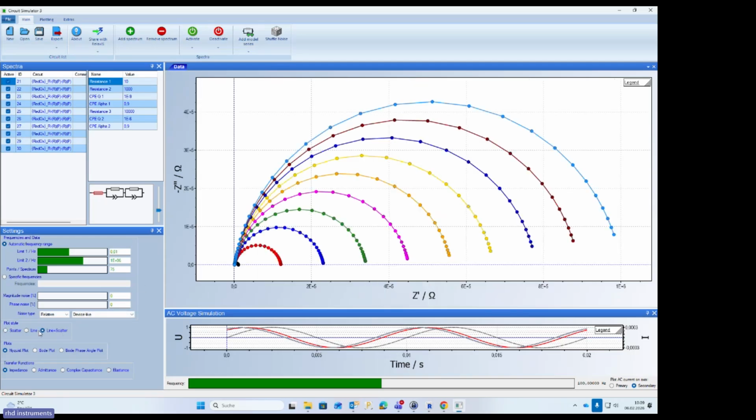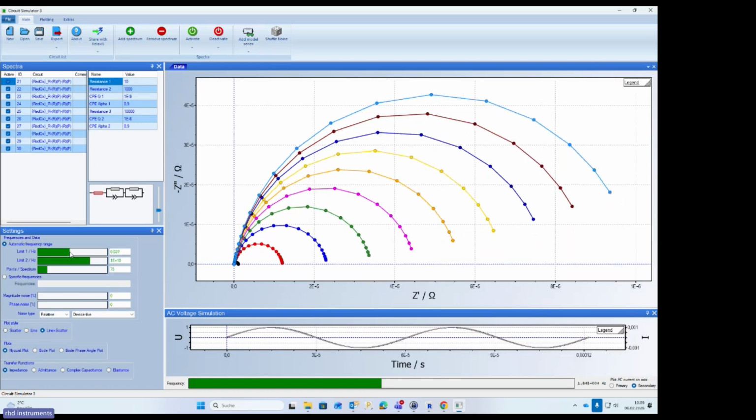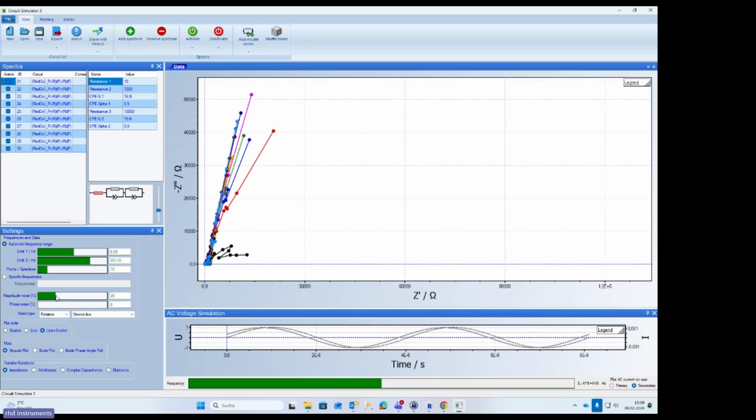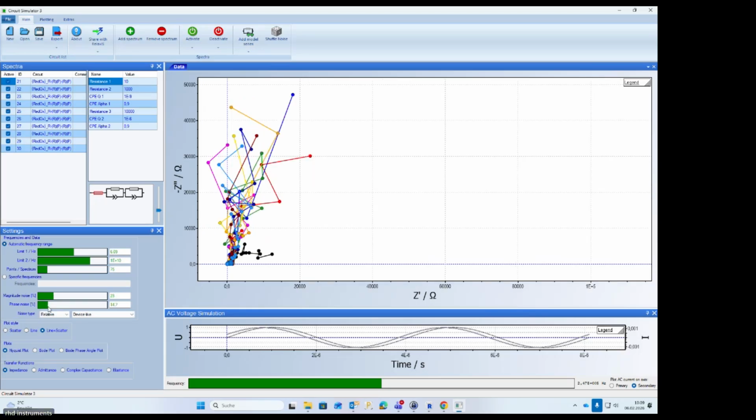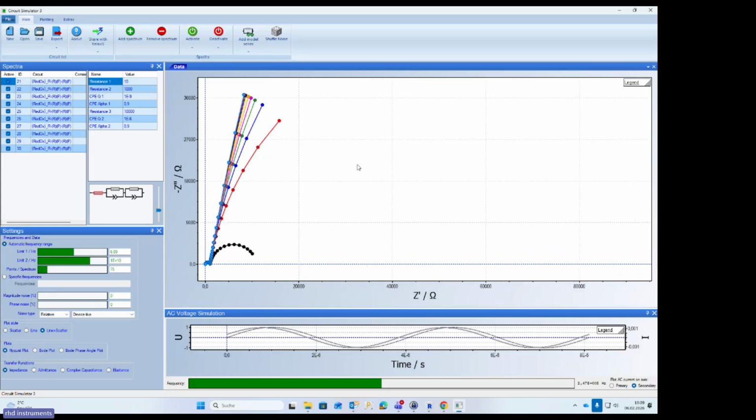You can also change the frequency limits here, for instance, to show how this works if you have other frequency limits, stuff like this. You can also add some noise. Where is it? Noise, to show how it should not look like, or add a noise also to phase angle. And this is not the best spectrum now, but here this is how it should look like. So this is for training purpose, educational purpose, and it also comes together with RelaxIS.